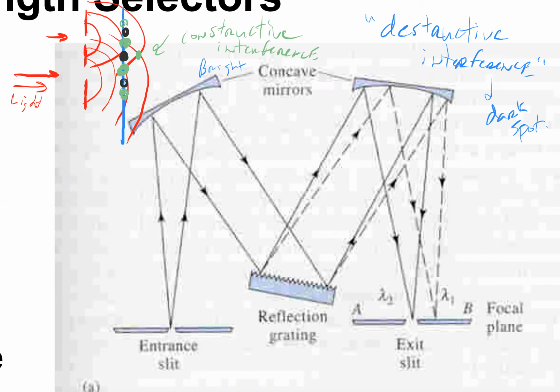And again, I'm discussing a very specific wavelength. One wavelength, monochromatic light entering these slits, okay? So you get this pattern. Now, because different wavelengths of light or different photons of light have different wavelengths, the exact location in space that these patterns appear, whether it be the light spot or the dark spot, will change with wavelength. They're wavelength dependent.